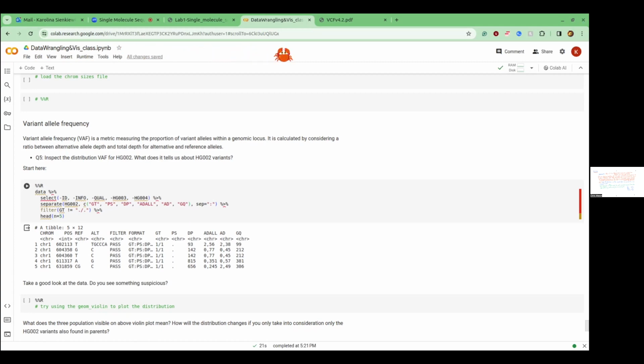If you calculate the difference between the most likely allele and the next most likely, it has to be like 60%. So the first one has to be 60% more likely than the other one. That's when it's an informative variant. If the reads are for variants that are informative, that's when they're going to be counted to AD. That's why AD usually sums to less, and that's why AD is the measurement that should be used for variant allele frequency calculation.